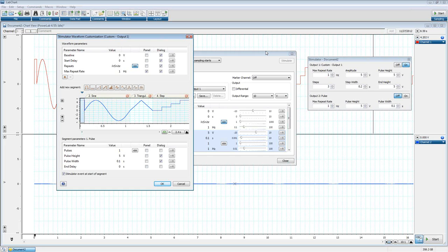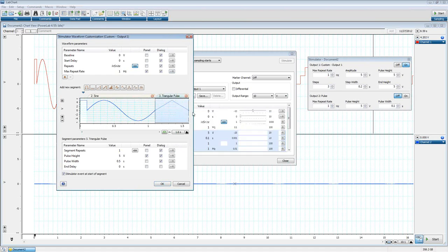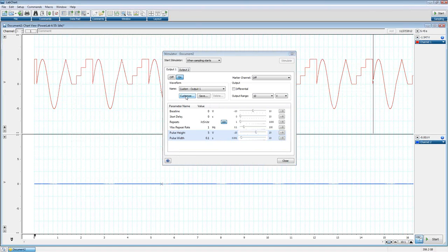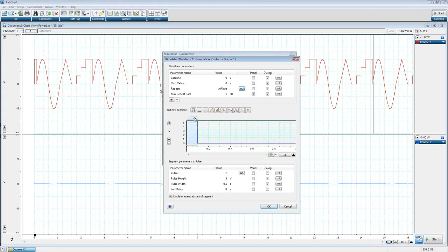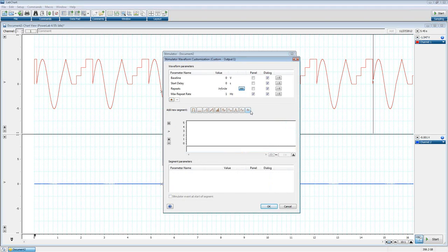So there is another layer to this, and that would be the arithmetic function. I'm going to go ahead and delete all of the little ones that we made here. We'll close things, close our panel and go back to customize. I'm going to delete the one that's here. You'll see there's this little button here that is FN. Basically, it's just a symbol for an arithmetic expression.